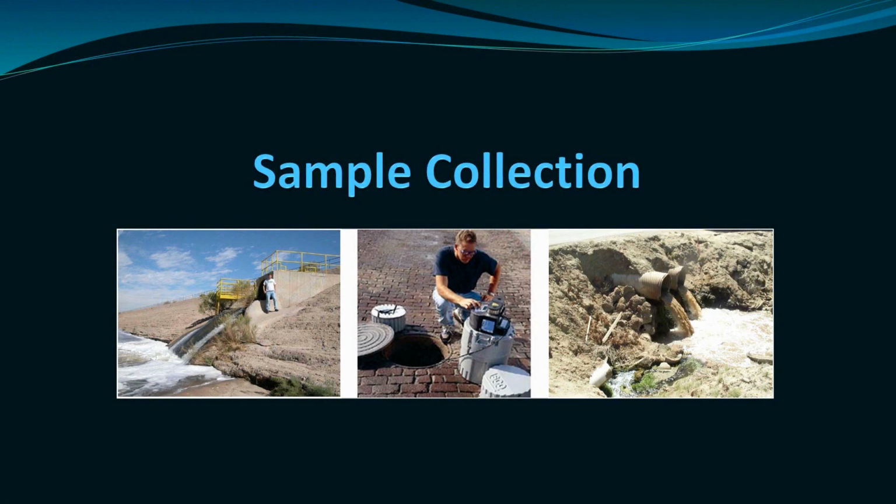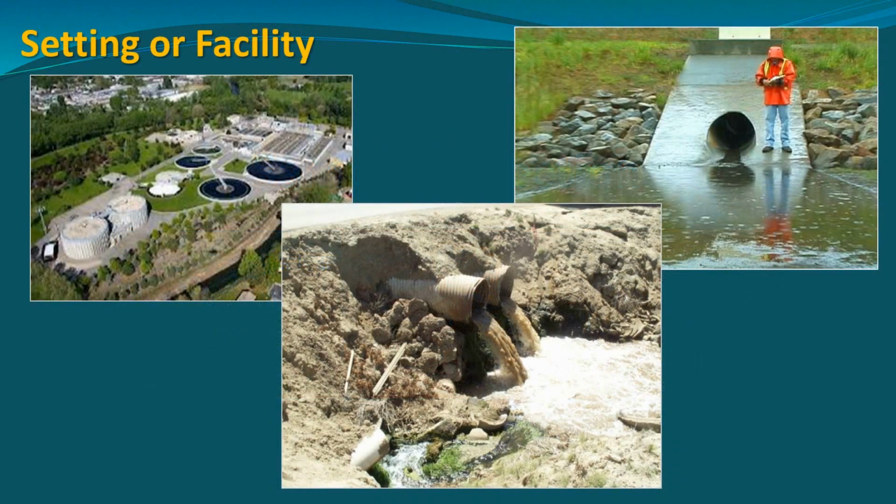Okay, so let's talk a little bit about sample collection. One of the things when we first started doing these workshops is we were using the terminology whole effluent toxicity, so it's WET testing, and it's now used a lot in ambient monitoring, just for the regular health of the environment type monitoring, stormwater monitoring, non-point source stuff. We use it for all different kinds of ambient situations at Granite Canyon.